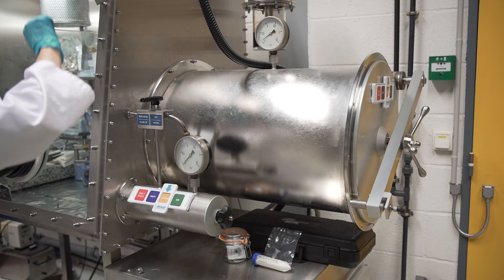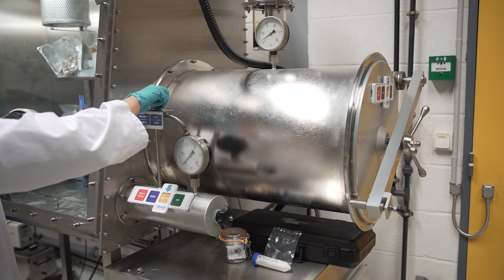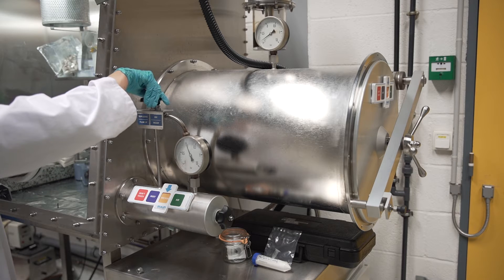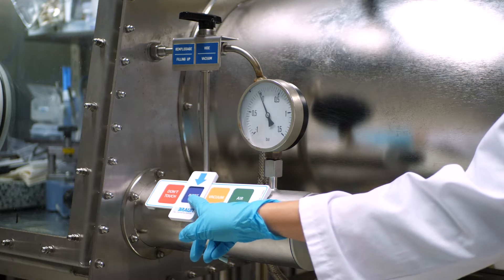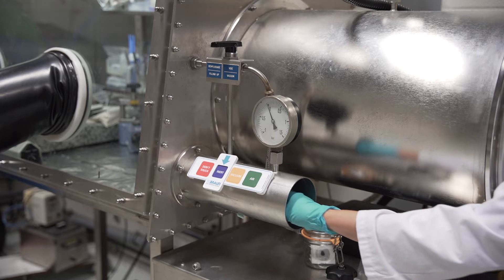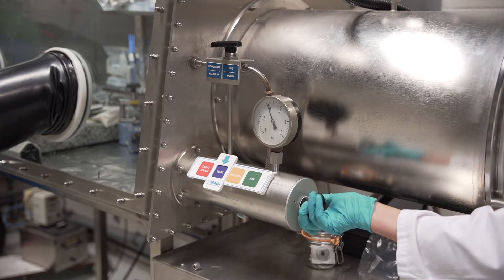For the small chamber: turn the valve on top of the small chamber one quarter turn to the left to return the chamber to atmospheric pressure — gauge needle at zero. Return the three-way valve to its position perpendicular to the chamber. Open the outer door of the small chamber by unscrewing the door anti-clockwise. Push the necessary equipment into the small chamber all the way down. Close the outer door.